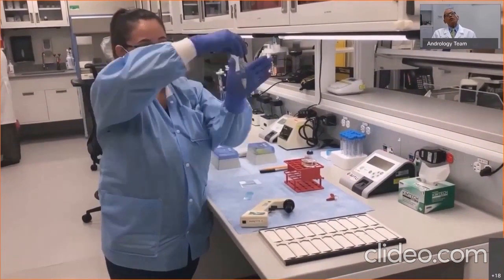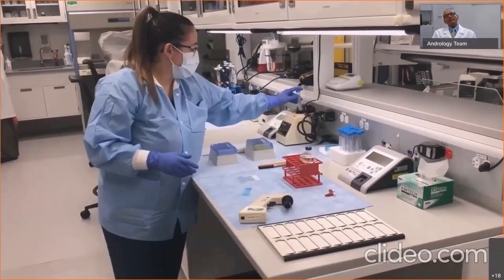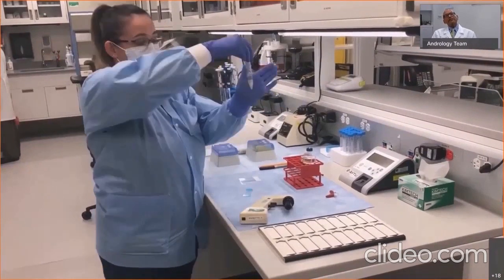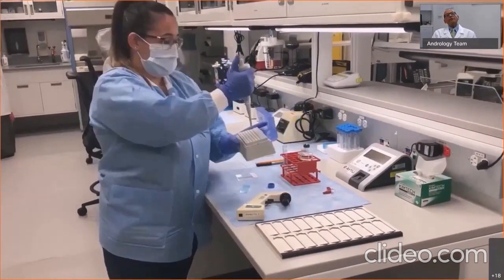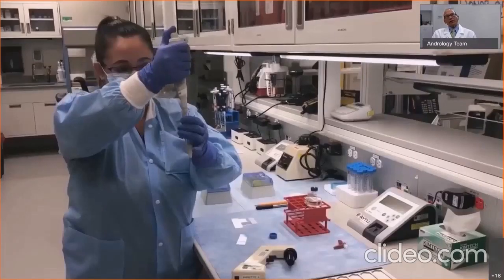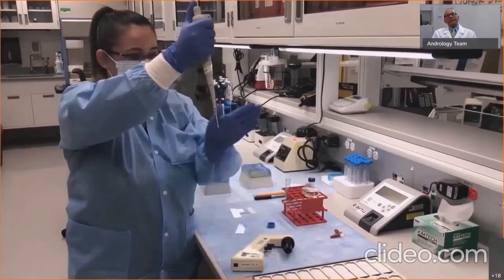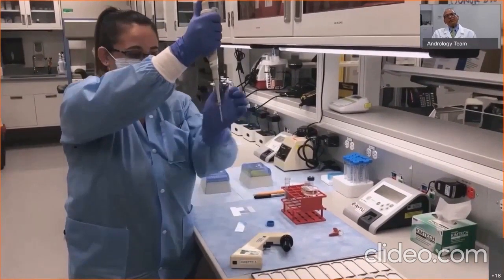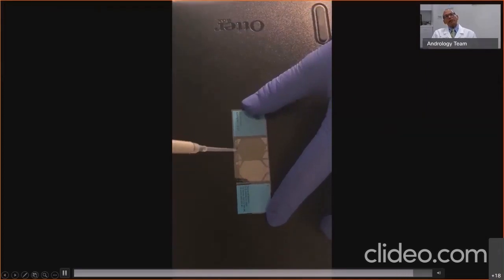And we check for the volume of the sample as well as the color of the sample. We quickly vortex using a vortex mixer and check the volume and the color. The next step will be to take a pipette and carefully load 6 microliters of the sample on one of the wells. And this is done by checking that the sample is adequately loaded in the tip and carefully releasing the sample into the well.